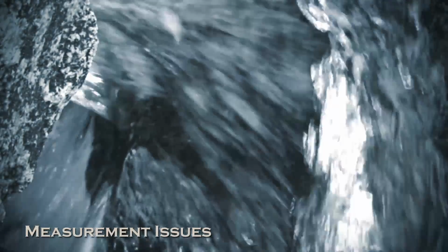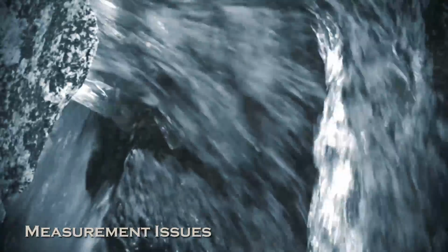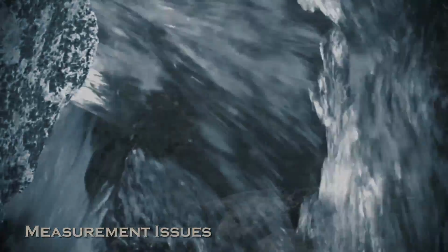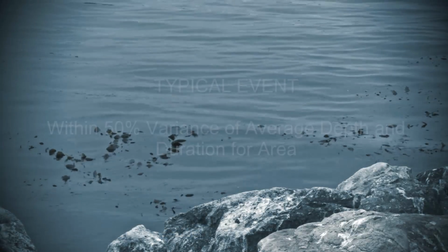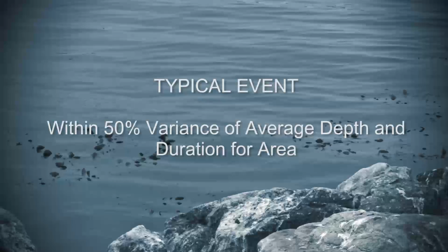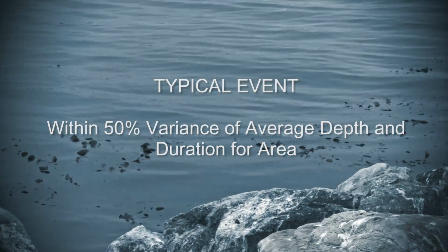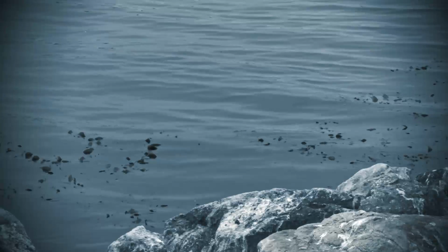Estimating flow is required for sampling. The purpose is to develop estimates of the total amount of pollutants in the entire discharge. The regulations require that the storm event sample be typical for the particular area. Typical is defined as being within a 50% variance of the average depth and duration of rainfall for the area in which the facility is located.